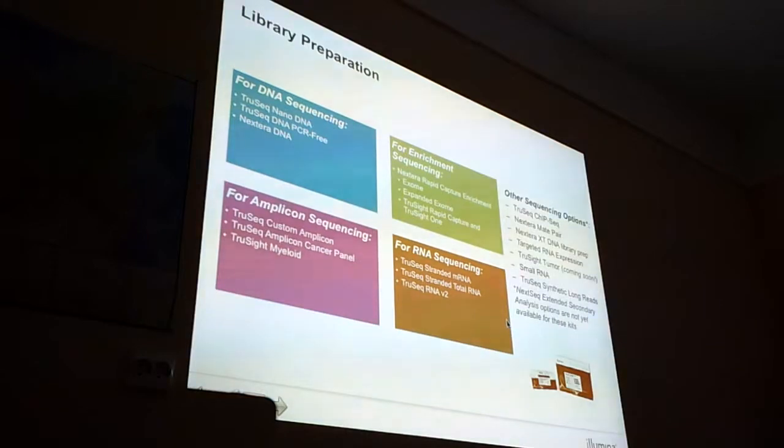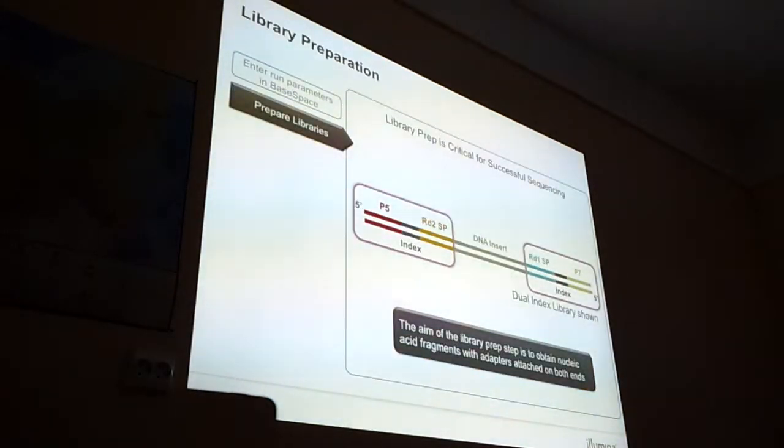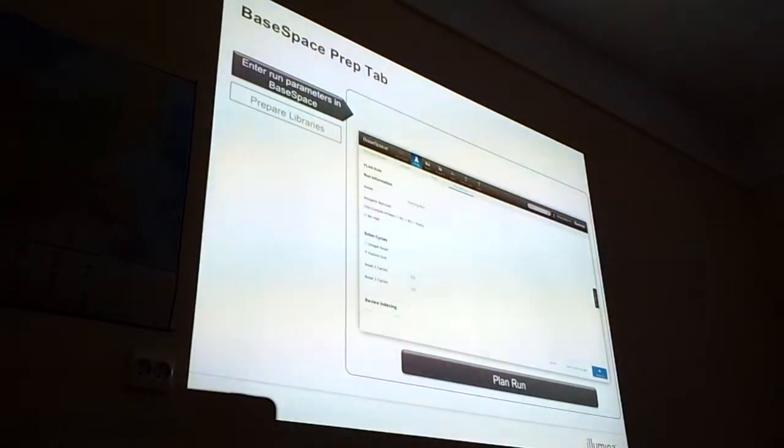Interesting. Sorry, can I ask a question? Yes. Can you go back to the cycle length selection tool? You told before, as we all know, that we have fixed kits with fixed amount of cycles, but before there was a window where you could enter the library preparation method, right? And here the software asks you again about the length of the read.